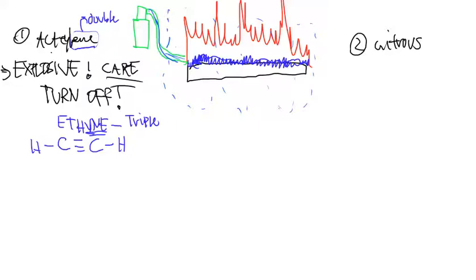The acetylene gas will create temperatures for us that are in the 2600 K range, and that's 2600 Kelvin. Okay, 2600 Kelvin, how hot is that? Well, you know that water boils at 100 degrees Celsius.